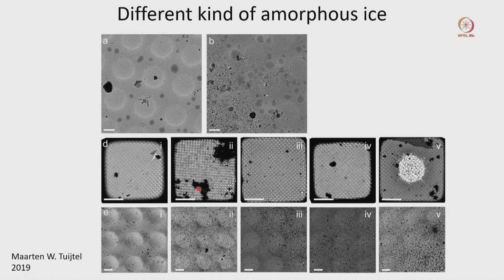This is again some kind of black ice contamination pattern. Those are the broken squares. Whenever there is a broken square, it is better to avoid it because you cannot adjust your eucentric height. Here you can see individual holes where there are some black spots.